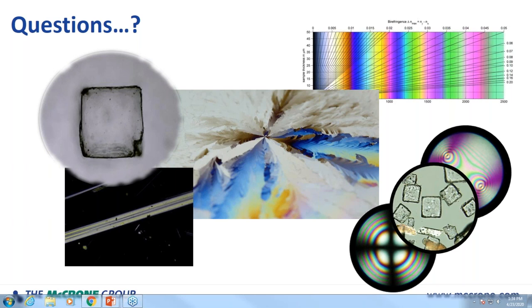A question from Dana. She wants to know, can this analysis be accomplished with a digital microscope? Absolutely.